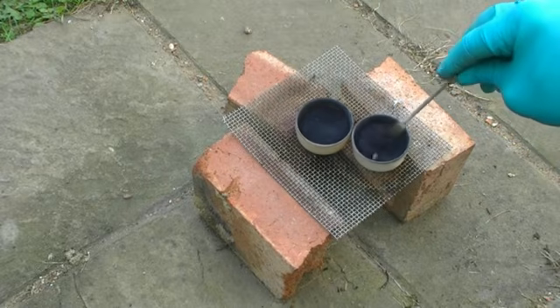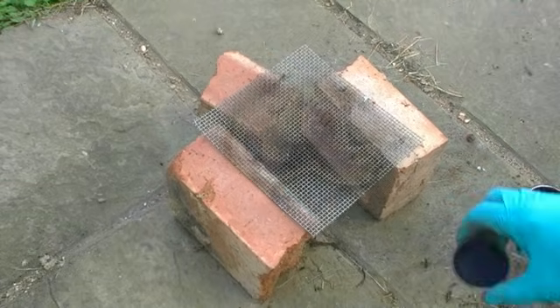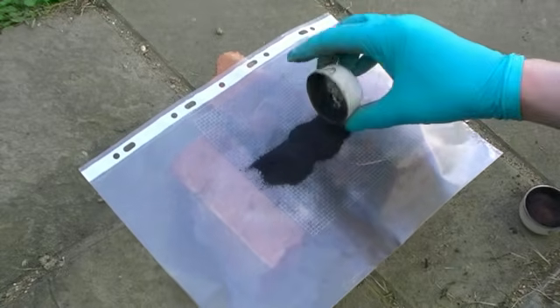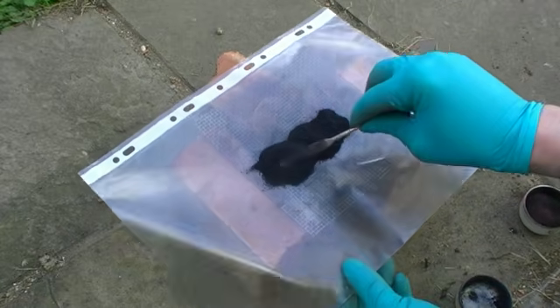After about 3 to 4 minutes of heating, we switched our gas torch off, allowed our powder to cool down back to room temperature, and let's see what we've got. If we empty our dish, we can see the powder is black in colour, and this is what you would expect for copper(II) oxide.